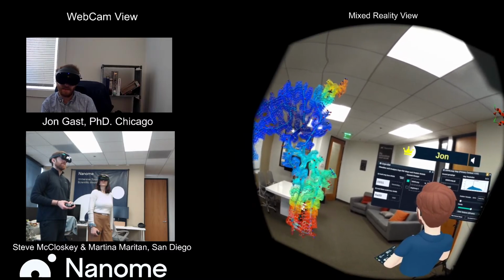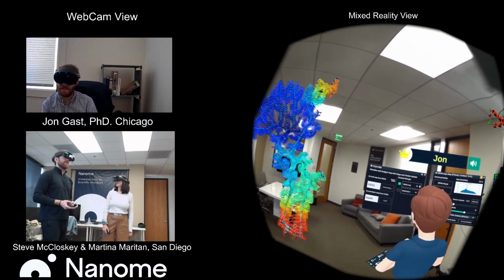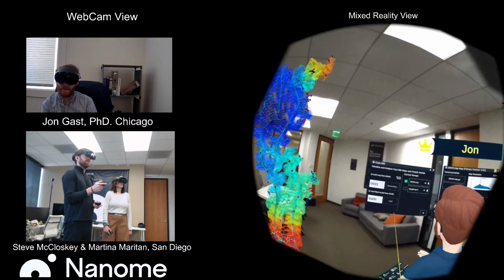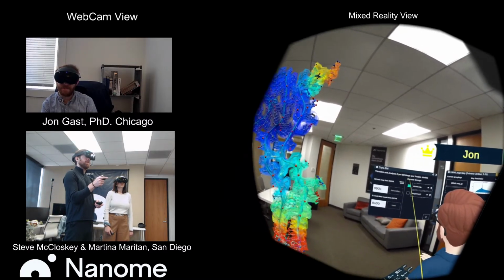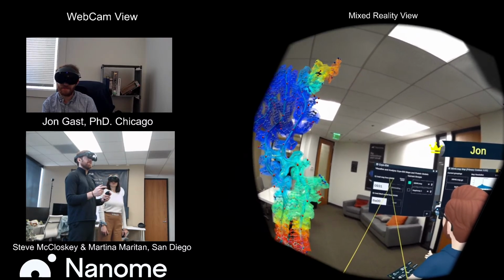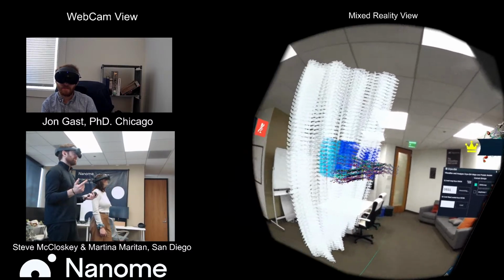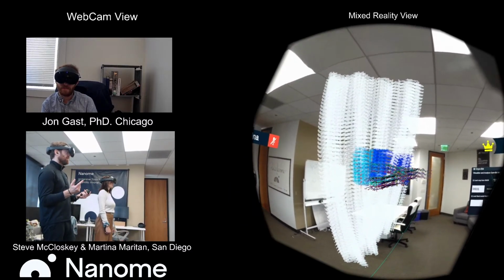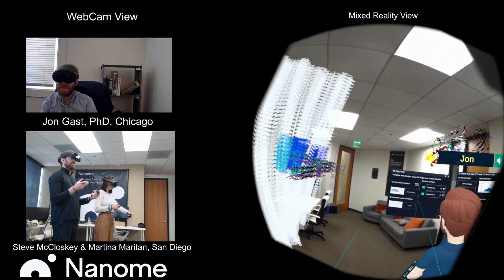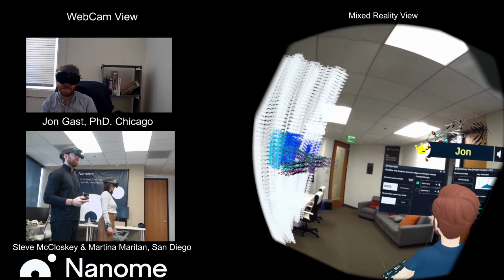But yeah, so I'll load in 6LNI. It's not too big of a step. As an initial implementation, we wanted to get something done so we could get started with EM maps. But really, instead of pulling from a database, pulling from a local file is entirely possible. We would just need to modify that plugin with a little bit of Python scripting. So look out for future releases. That should be on the roadmap.